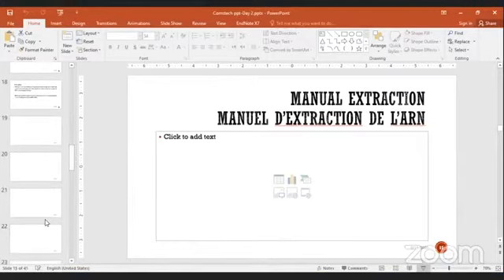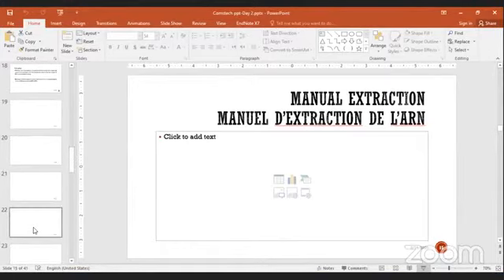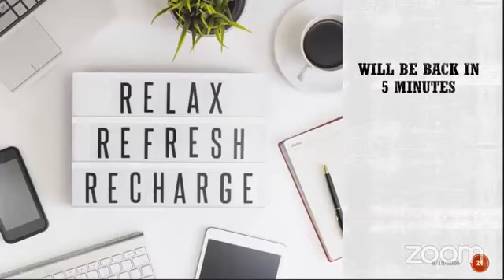Now, after the manual RNA extraction, there is a time for the 5 minutes break.